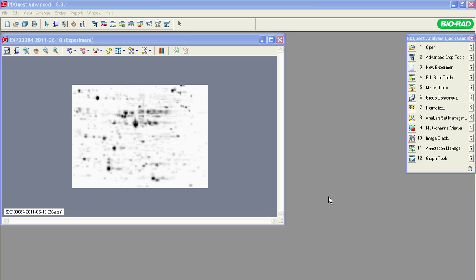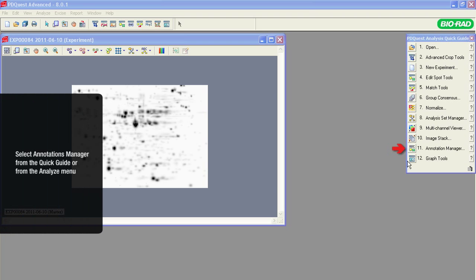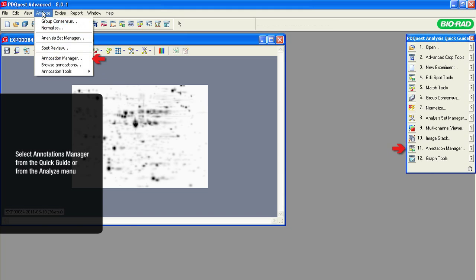In this tutorial, we will practice how to use annotation tools to describe and illustrate protein spots on gel images. Select Annotations Manager on the Quick Guide or from the Analyze menu.